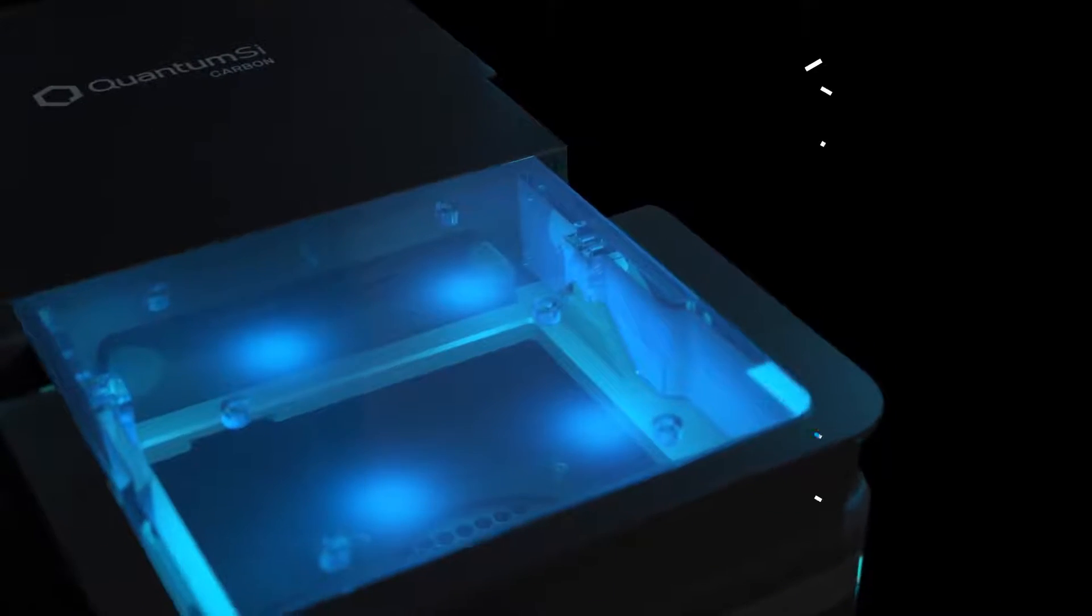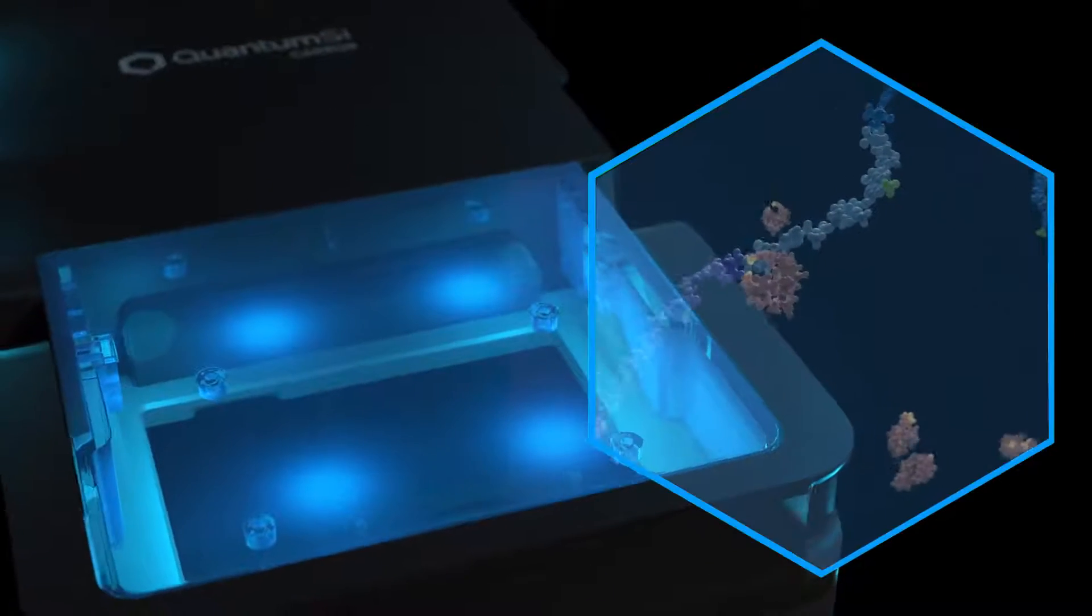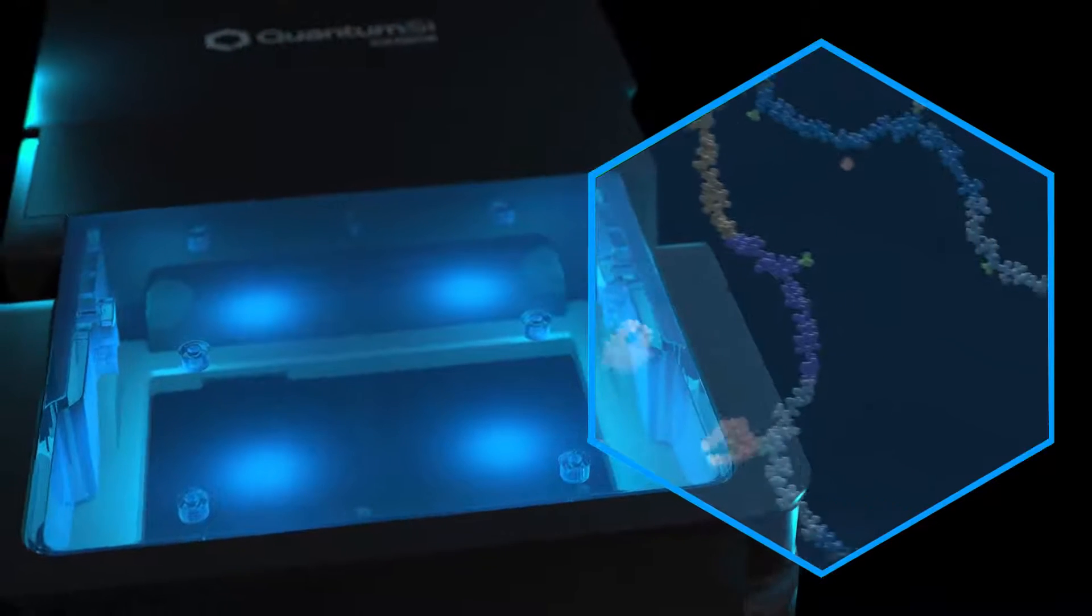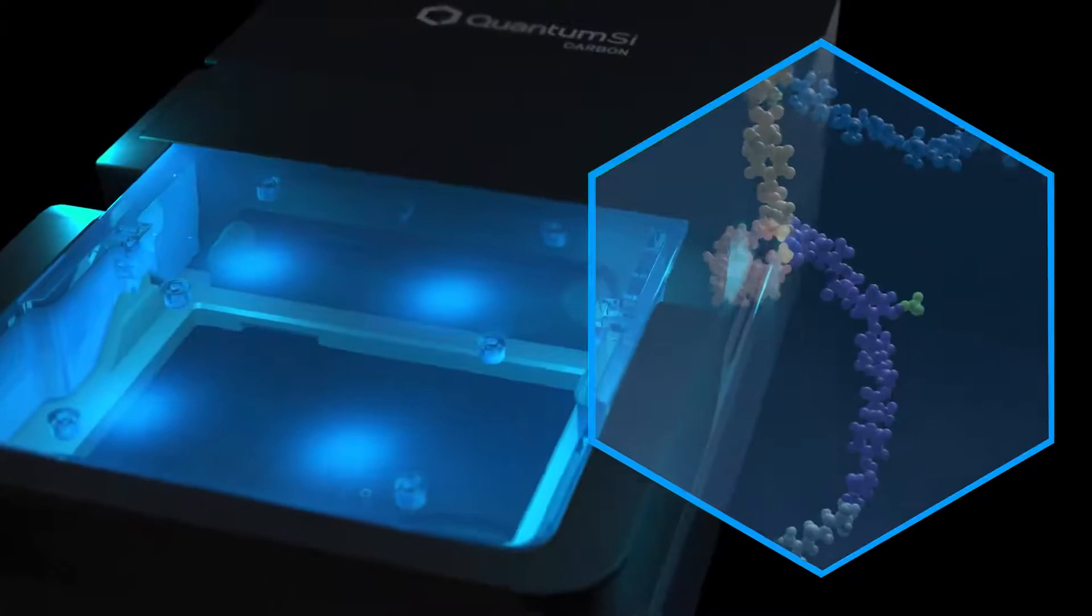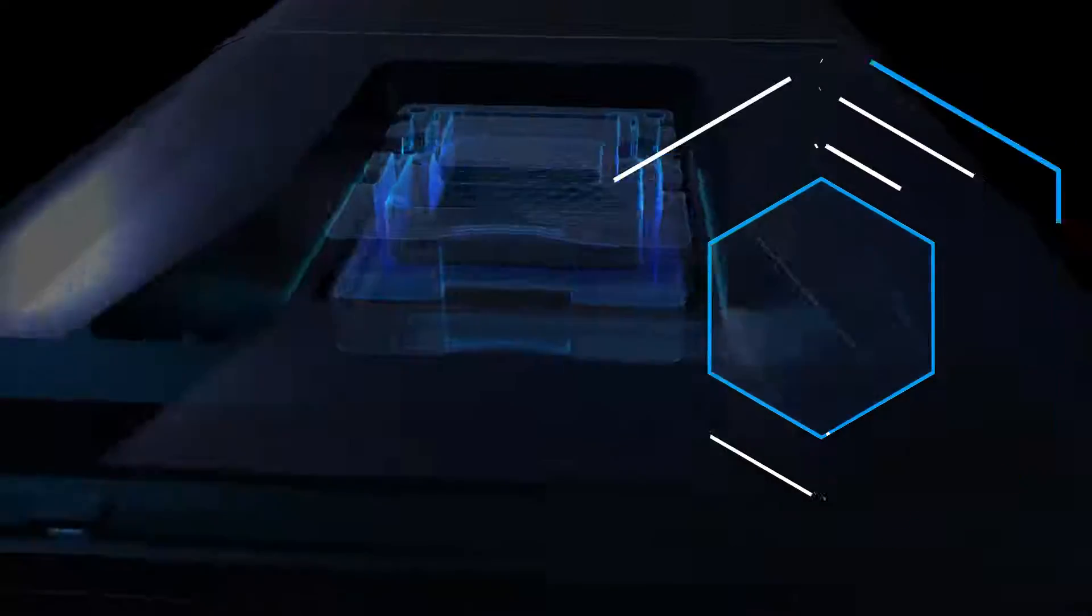Sample prep begins on Quantum SI's carbon instrument. We isolate proteins and digest them into peptides. Peptides are distributed into individual wells on our chip which is loaded onto Quantum SI's platinum sequencing instrument.